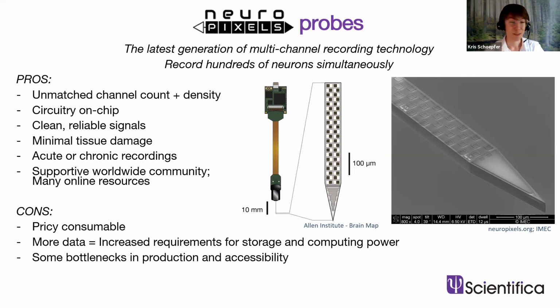Because of the massive amounts of data you can acquire with these, this does also massively increase the need for adequate storage, data storage solutions, and more compute to work with the data. Finally, there are a few bottlenecks in the Neuropixels probes production and assembly and accessibility, such that there is generally a somewhat long wait list to get your hands on some of these probes.